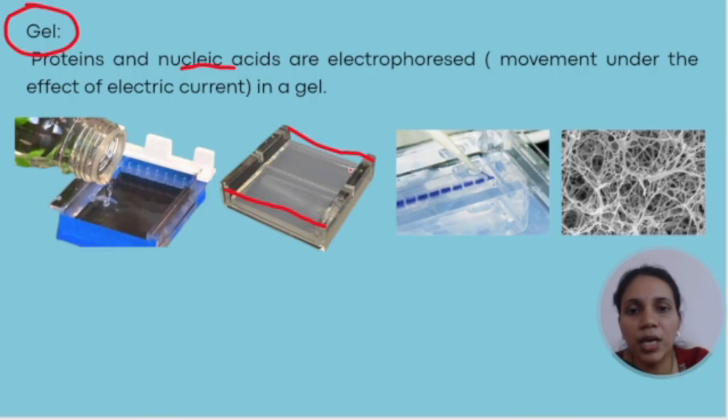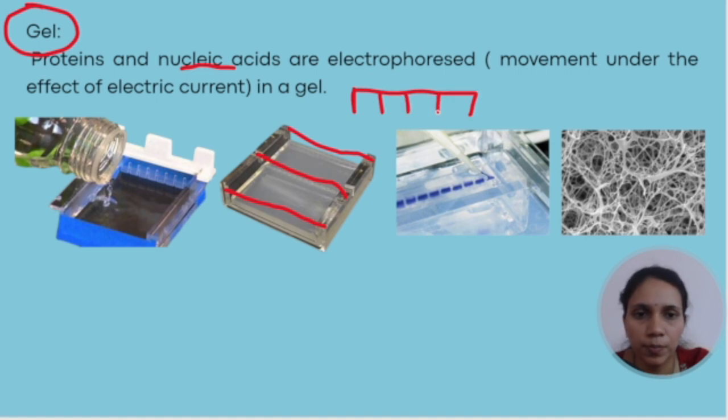When the gel is still in liquid form, we are going to insert a comb over here. This comb will have teeth, the way we have on our hairpins. It is inserted over here and here. As the gel hardens, it will form depressions. When we remove the comb very carefully, we will see depressions here. These depressions are called the wells, and this is the place where we are going to load the sample with the help of our pipette or the micropipettes.